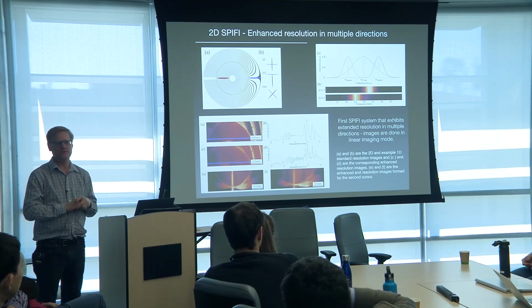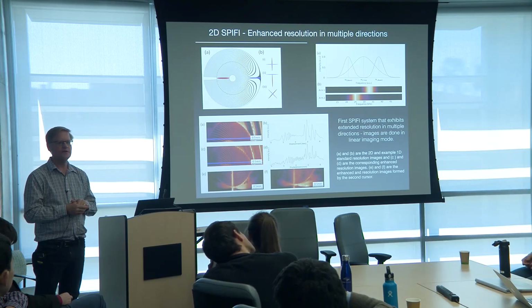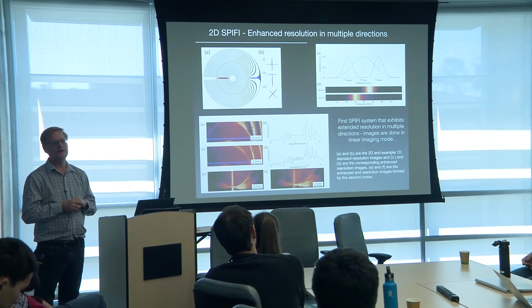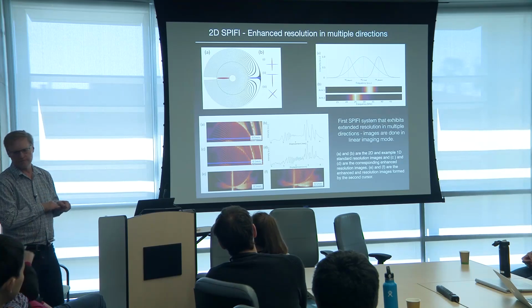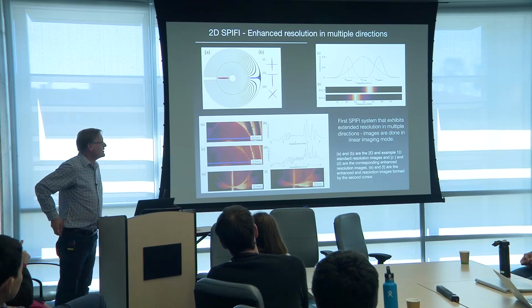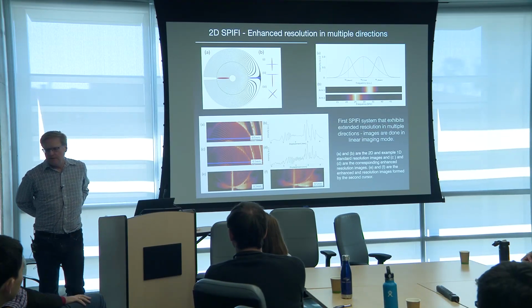Is it exactly a Fourier transform or is it an approximation? No, we just do regular Fourier transforms. It's a real Fourier transform. So the quality of your reconstruction is based on this mask being clean and rotating at constant speed, or am I missing something? Oh yeah, no, if your mask wobbles, we can correct for wobble.